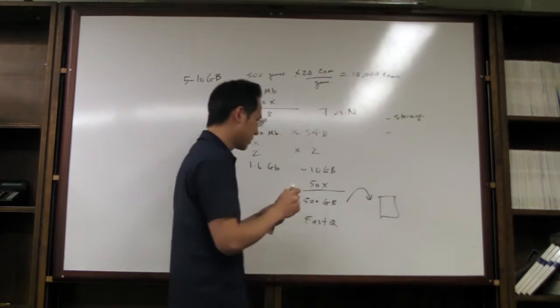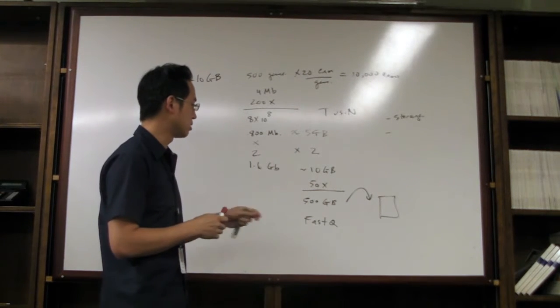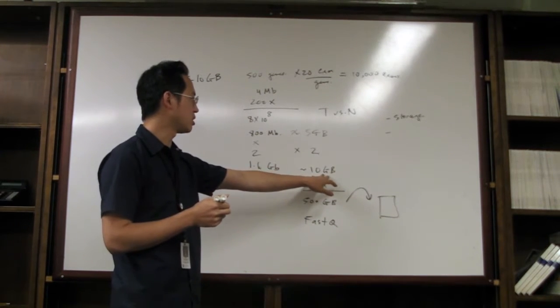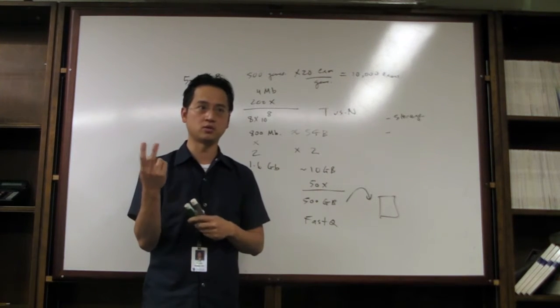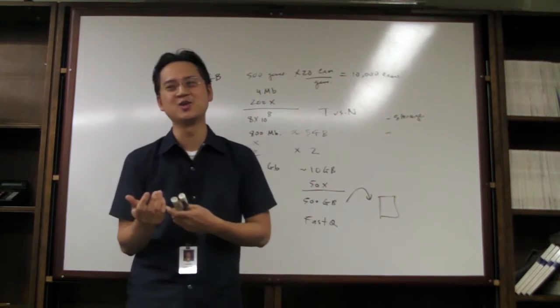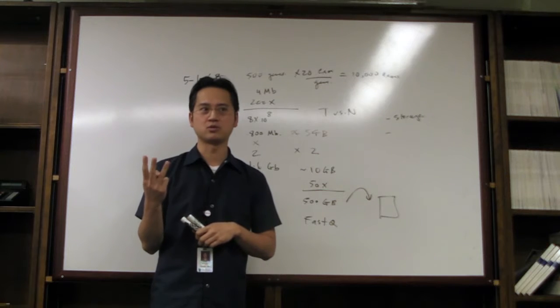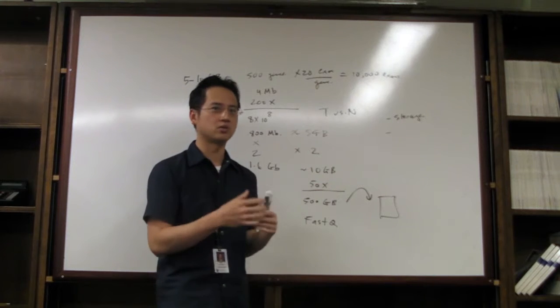The second problem is doing the analysis itself, right? The analysis in terms of doing this process takes a lot of computing power. If you were to try to take this 10 gigabyte file and run it on your desktop right now, your partner's workstation might have 2 cores of CPU computing power. Actually, it won't even run because you only have about 2 gigabytes of RAM on it. For the fastest mapper out there, you need about 3 gigabytes of free RAM to accommodate the human reference genome. And then thereafter, a little bit more to make sure your computer is running.